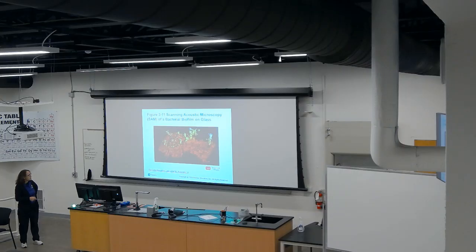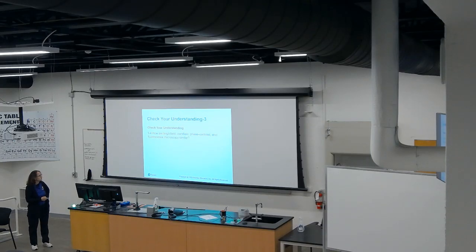So here we have a glass on the bottom and then this biofilm with some of the extensions of the bacteria here in this biofilm. They tend to form these little colonies that we call biofilms, and then some of them stand to the top in order to detach from the surface so that they can go and migrate to another place, and then they can get nutrients from that other area where they go.